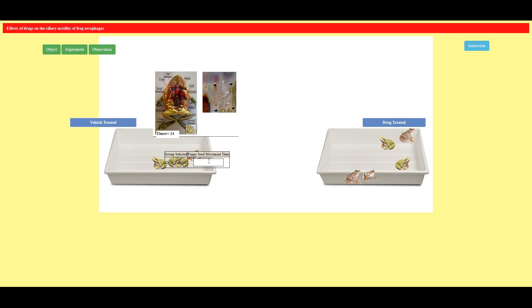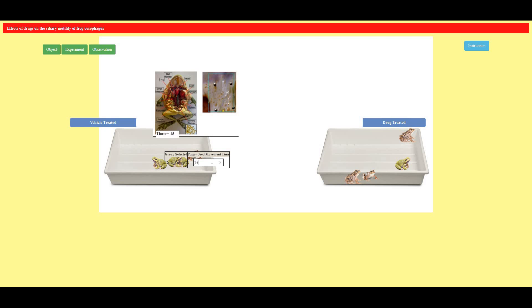That is 15, sorry 16 seconds. Again I'm selecting a frog which is treated with acetylcholine. The time taken is 15 seconds.